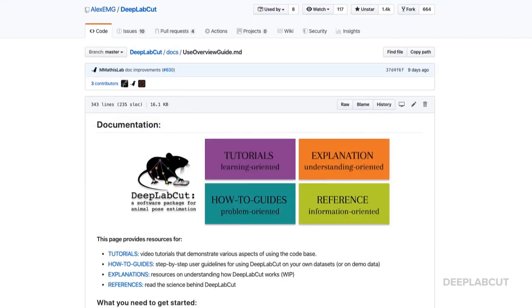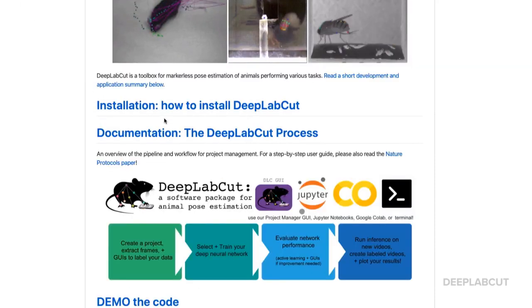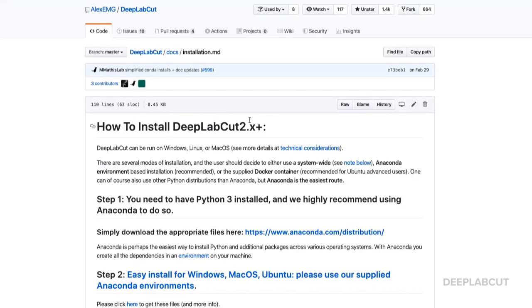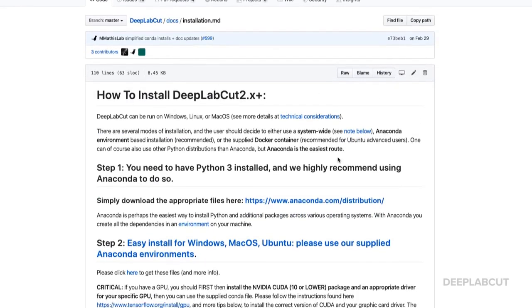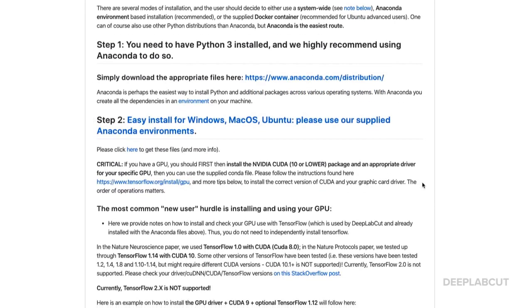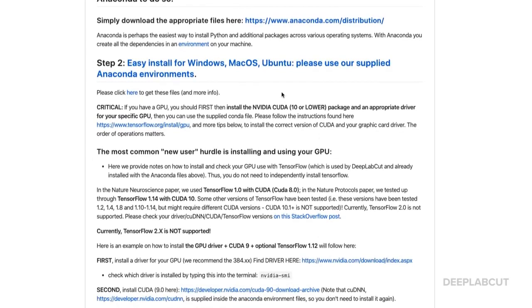Let's jump back to the main repo. Here you can find the installation guide, for example, which takes you to a subpage talking about how you need Python installed, if we prefer Anaconda, and also easy installs for Mac, Windows, and Ubuntu.